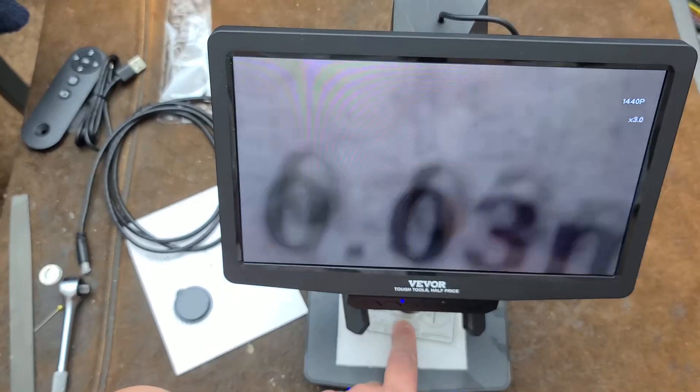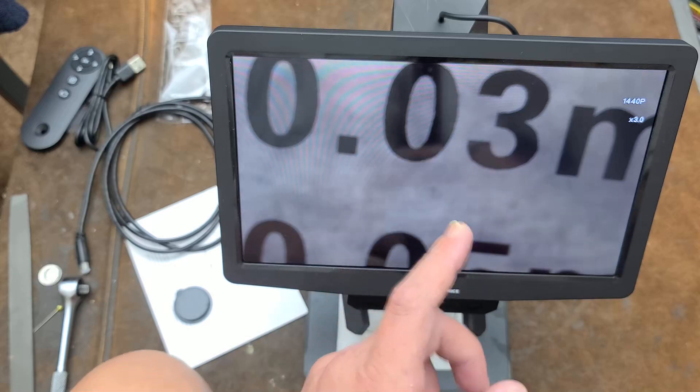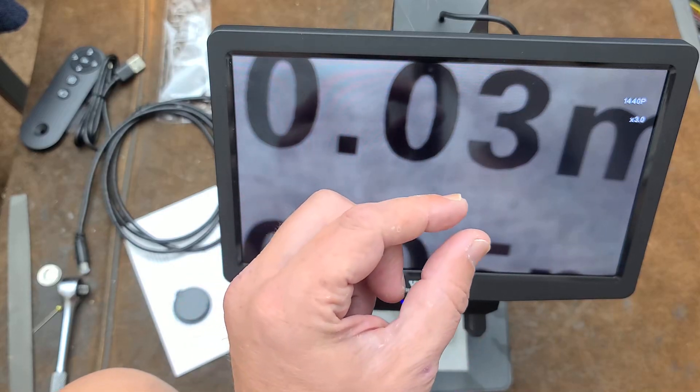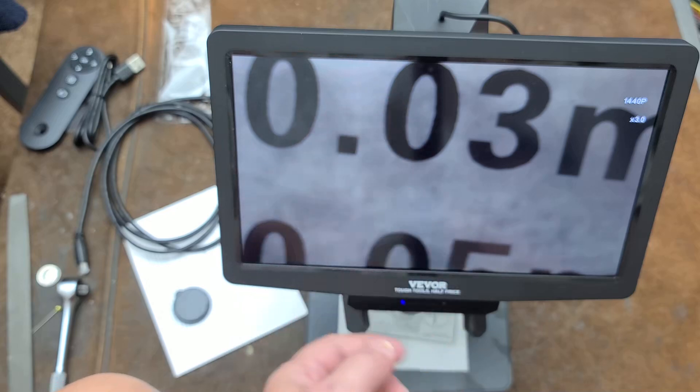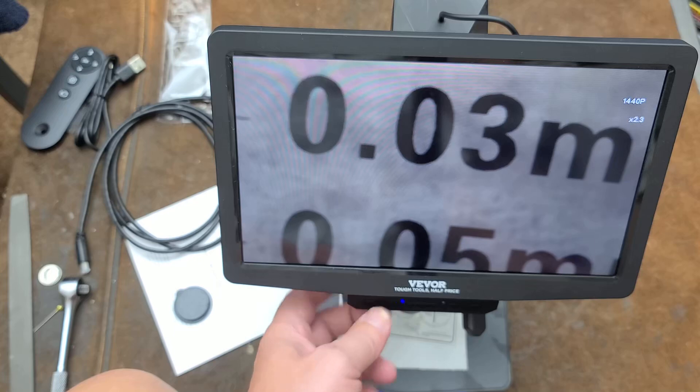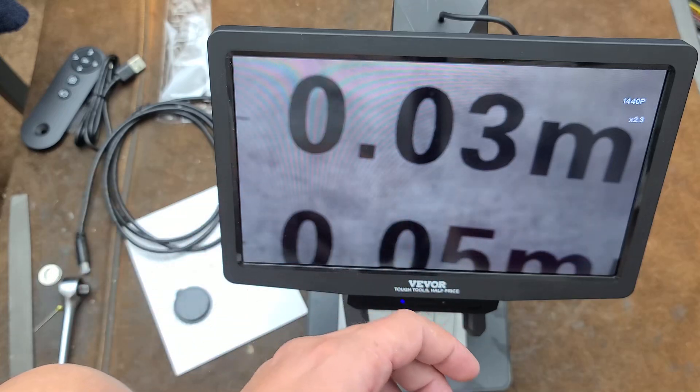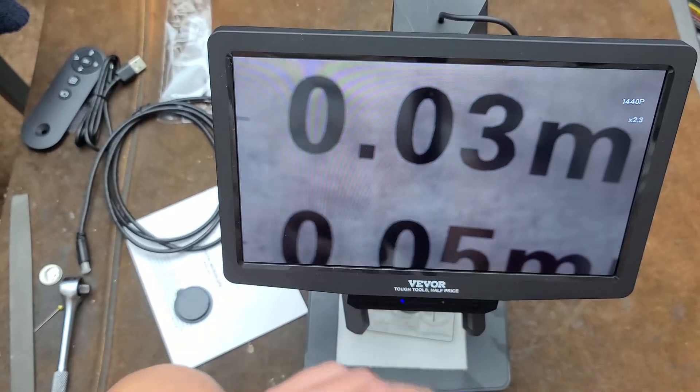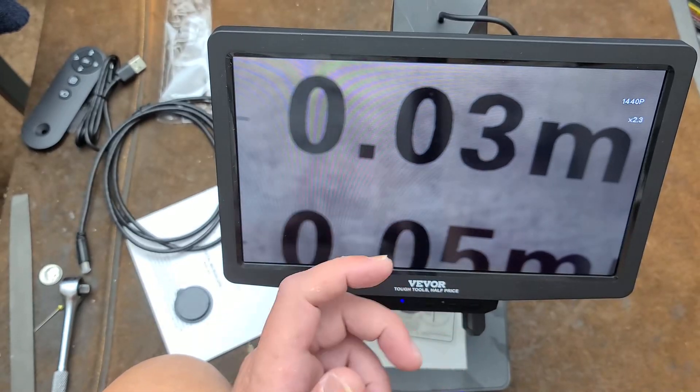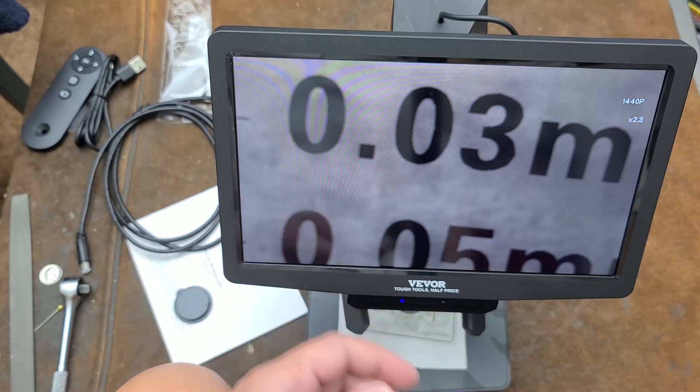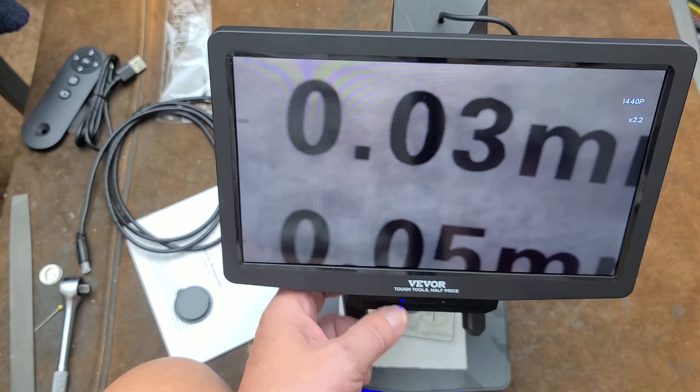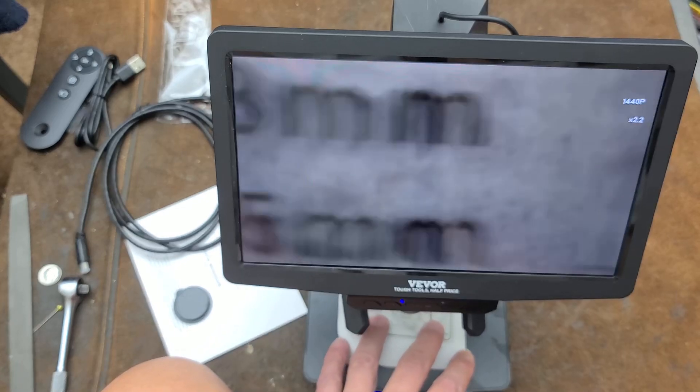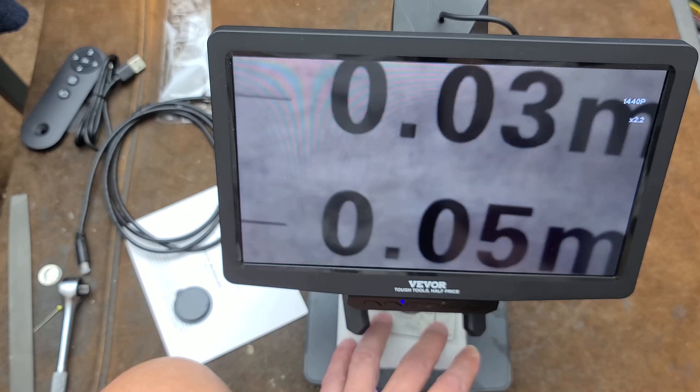When you're this close your focal range diminishes, but as you pull far away your focal range increases. That's a couple of things about being built post-2020. They're just using these super mass-produced cell phone camera sensors because they're super cheap and they're actually pretty high quality, especially for devices like this. You get things like this must be 30 frames a second, so it's just plenty of response time, really good low light.